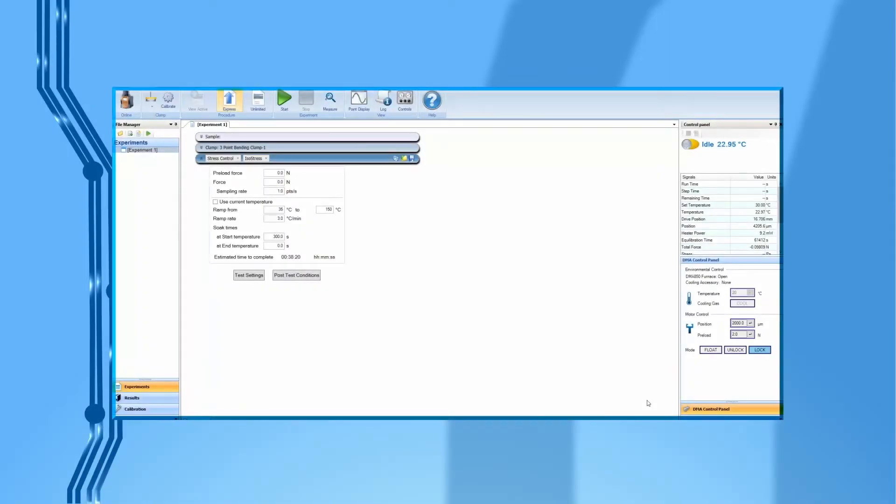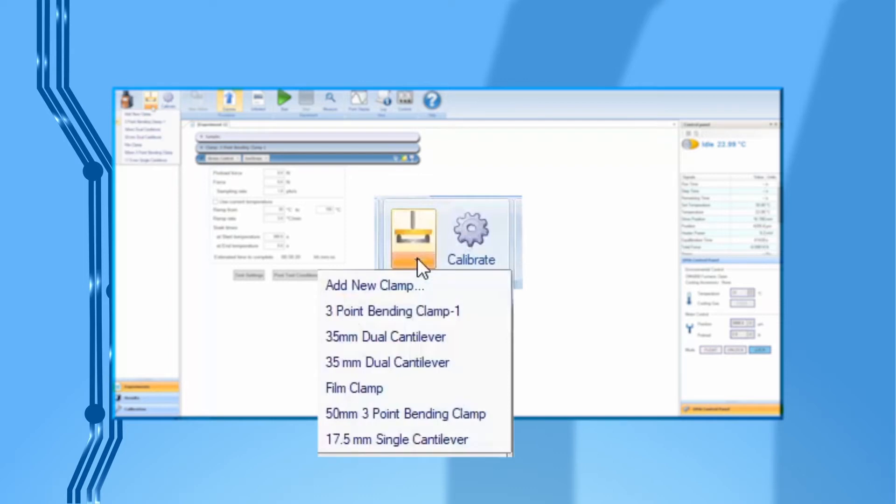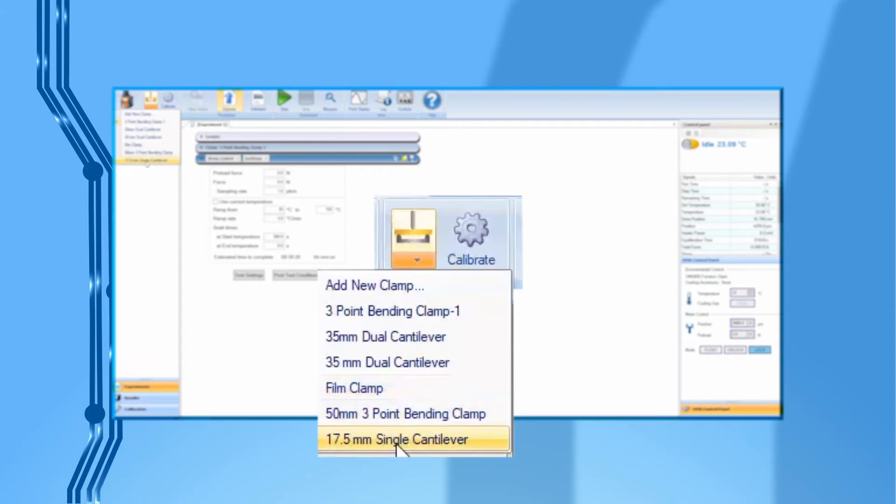Open TRIO software and connect it to a DMA850. Under Experiment, click on the arrow on the clamp icon. Select the name of the clamp you want to install and calibrate, for example, 17.5 mm single cantilever.